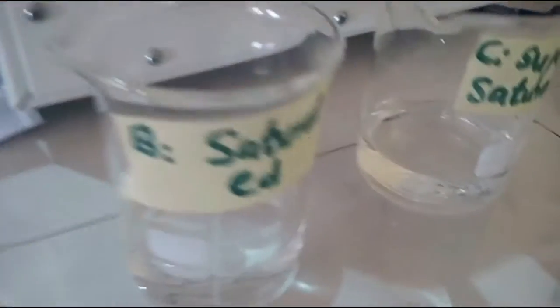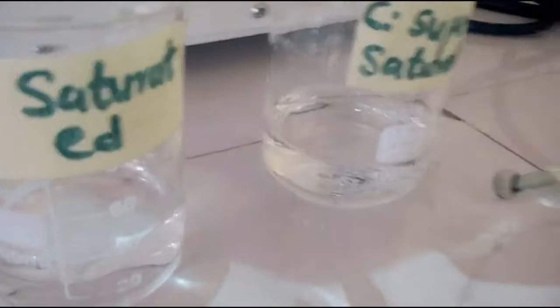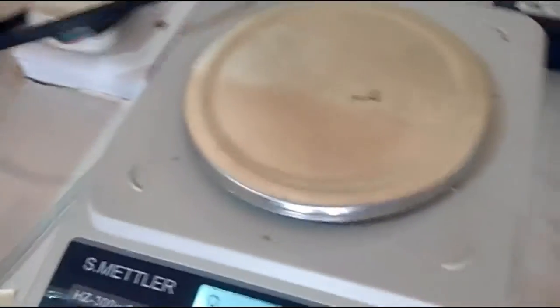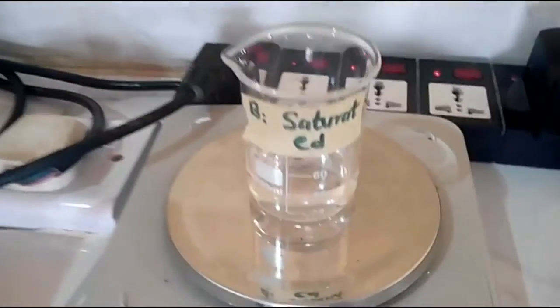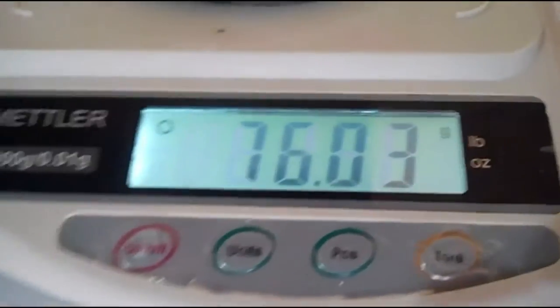To find the exact mass of sodium chloride that will form a saturated solution in 40 ml of distilled water at 30 degrees centigrade, we'll first weigh our beaker B on a weighing balance. Here, the weight of our beaker B is 76.03 grams.